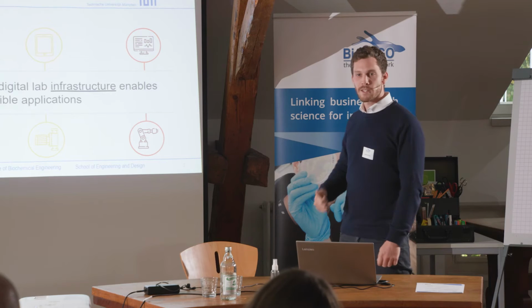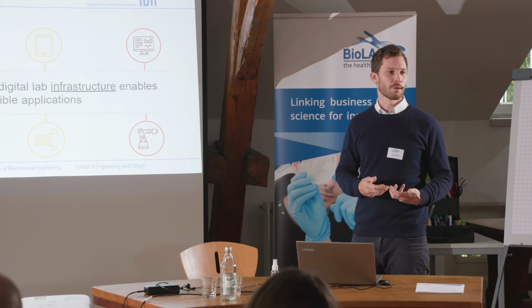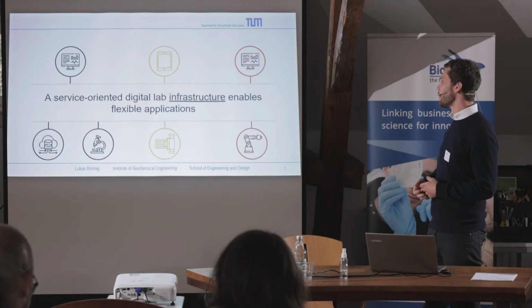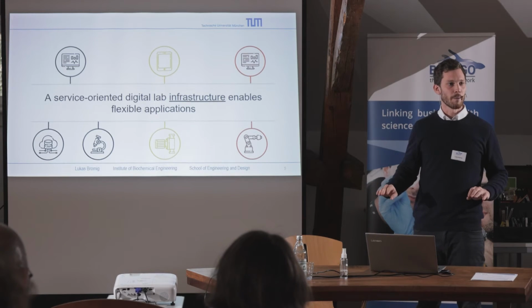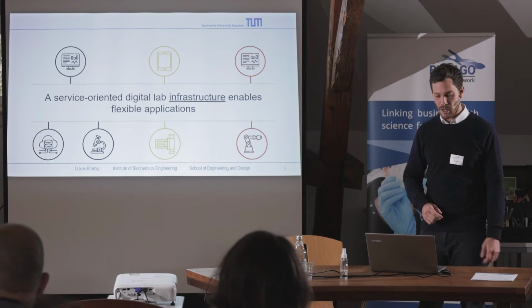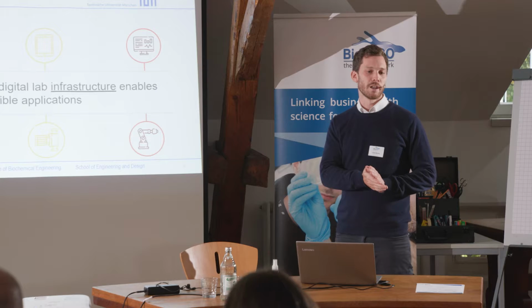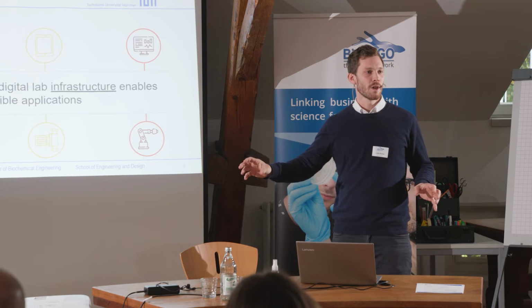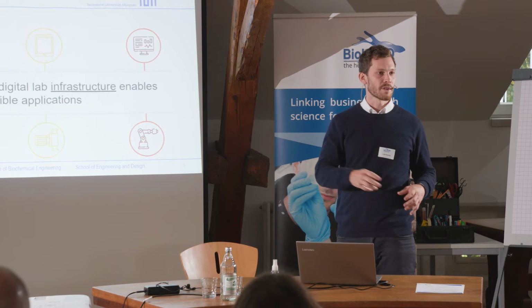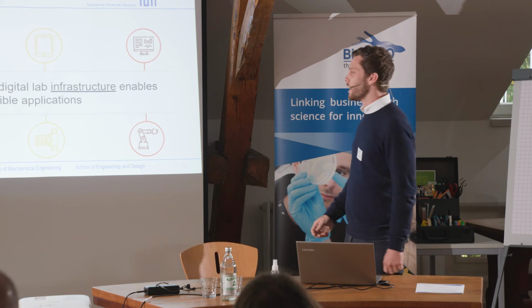Now you want to be more flexible, and if you want to change the software that you use for your processes, for your control, or if you just want to use scripts, you always want to access this infrastructure level at the bottom, and SiLA enables us to do that, to keep things flexible, so that one day we integrate this parallel bioreactor system with our pipetting robot. The next week we integrate it with some auto-sampler and a peristaltic pump.